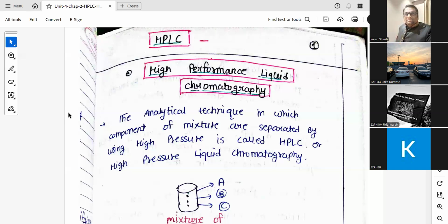So basically, now moving towards chromatography, we are very much acquainted with the concepts of chromatography, as well as retention time, the equations, dead volume, and thereafter HETP, and all these things. Thereafter, we have seen column chromatography also, ion exchange chromatography, and gel chromatography. So that has helped us.